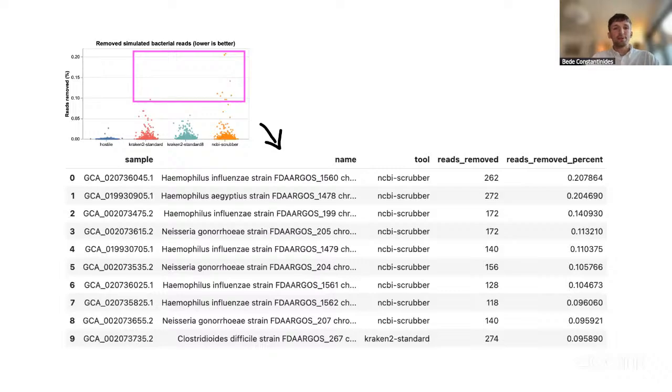And if we drill down on some of those bacterial genomes from the last figure in the last slide, and we look at those that are sort of most wounded, so to speak, by the process of host depletion, we see that it includes some really clinically important genomes like Neisseria gonorrhoeae and C. difficile. And we're not talking about reads randomly, evenly distributed across these genomes. We're talking about gaps in coverage, systematic gaps causing missed variant calls, broken genome assemblies, and that sort of thing. And we don't want those in our analysis.